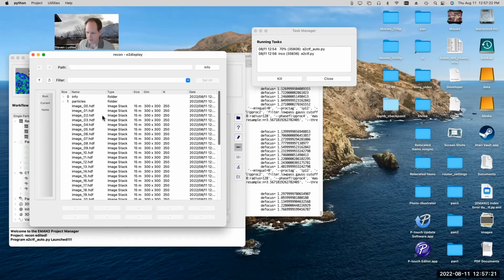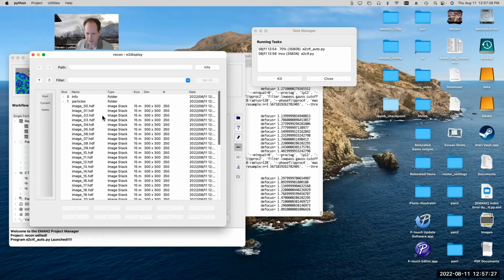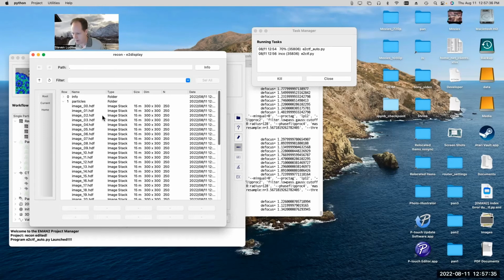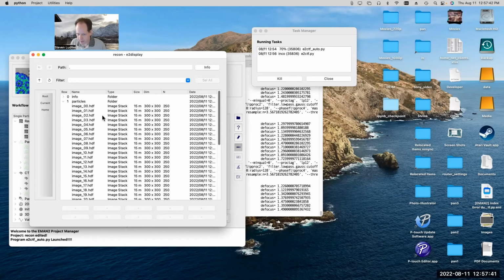Right. So it was basically doing an exhaustive search of every possible defocus and other parameter on whole micrographs. So it was very expensive, but it tended to find the right local minima because it was basically checking every point. Gotcha. Some of the other tools, like the EMAN tool, were faster and more efficient, but occasionally they would get it wrong in certain types of cases.